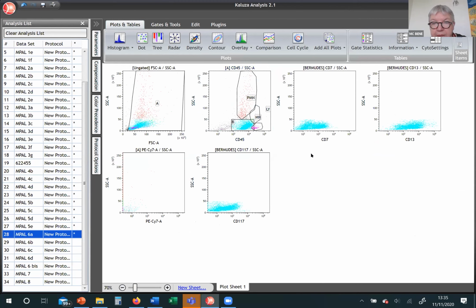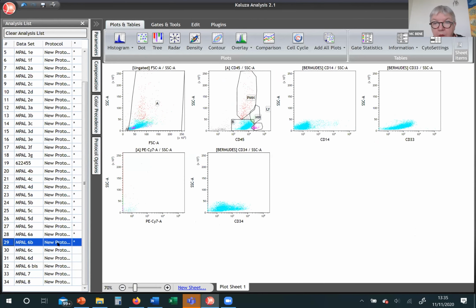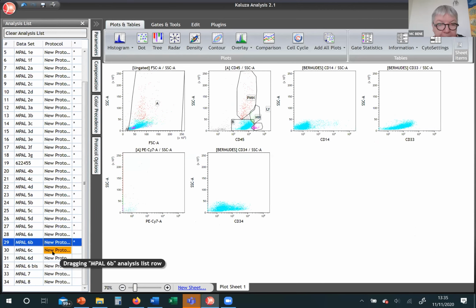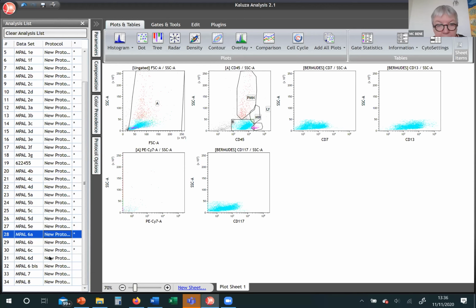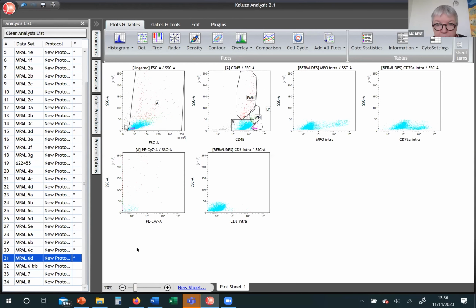So what do we have? We have some CD7, CD13, 117. No 14, some 33, a little bit of CD34, partial expression. CD36, and now we have CD19. So perhaps the 7 that we saw on the first plot was something that would go with the myeloid profile because it was only partial. And then we see here that part of it is clearly CD19. And then if I go to this one, I will find very tiny MPO, but I will find again my CD79A intracytoplasmic.